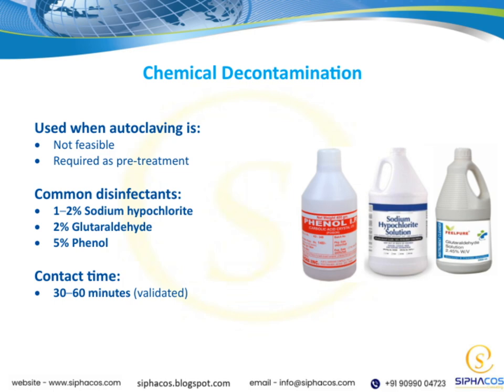So, in summary, chemical decontamination is a vital alternative when autoclaving isn't an option, and choosing the right disinfectant, along with proper contact time, ensures effective decontamination and safety in our practices.